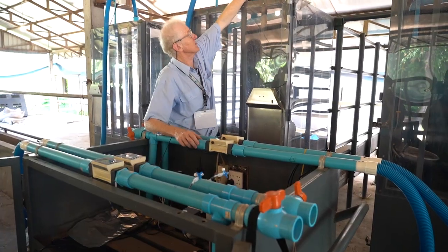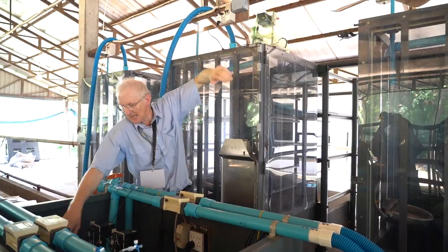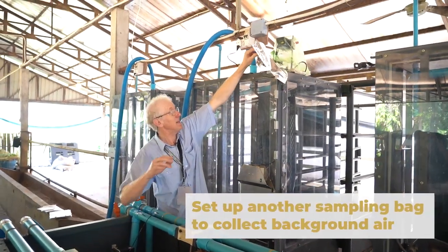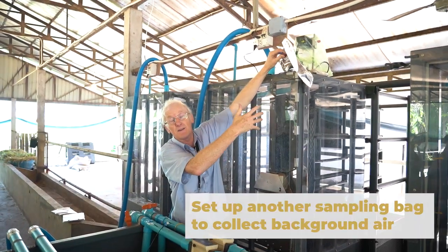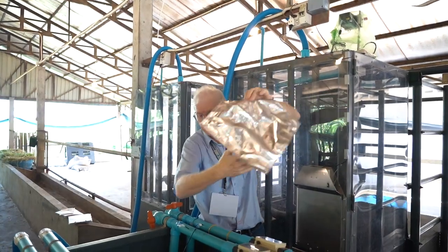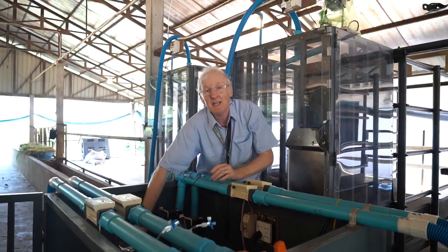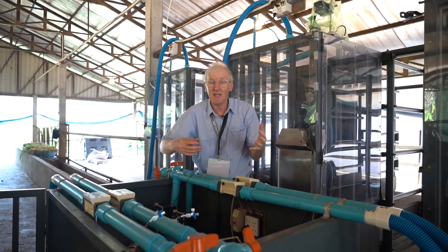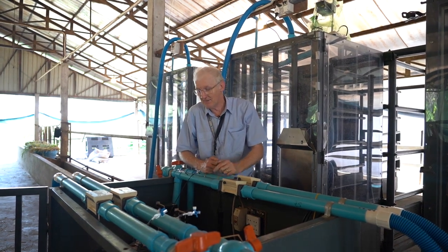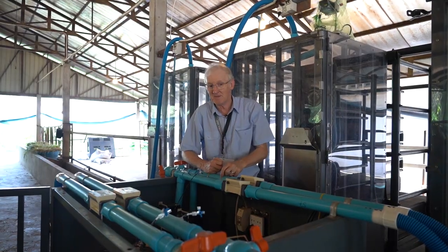So we have got it all still wrapped up in a bag here, but we must set up another sampling bag up here that is collecting air from around the back of the chamber where the cow is, so that we get a sample of background air. Because in an animal house there might be 2, 4 or 8 parts per million of methane, and we need to allow for that methane going into the chamber as well as allow for the methane that's coming out from being produced by the cow. So I think that is pretty well our airflow system.